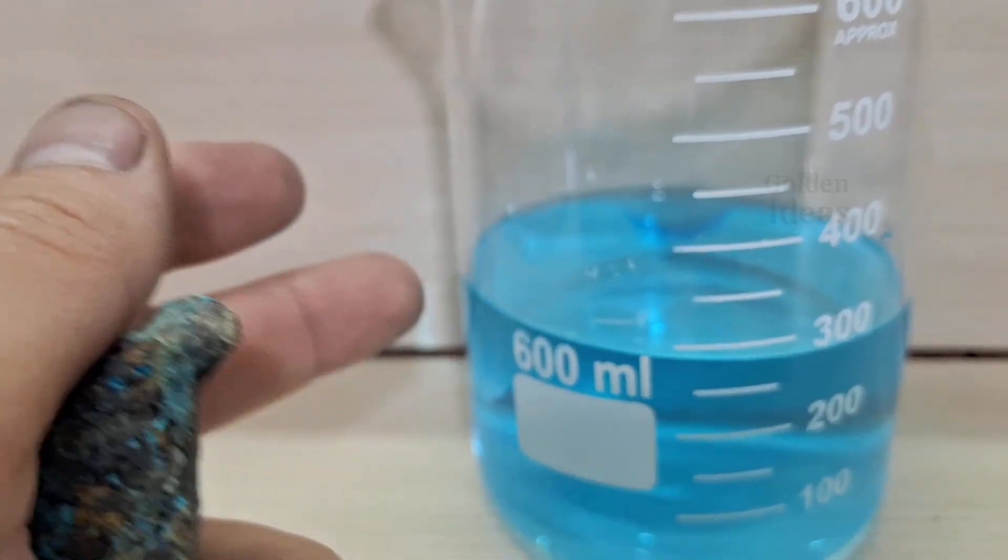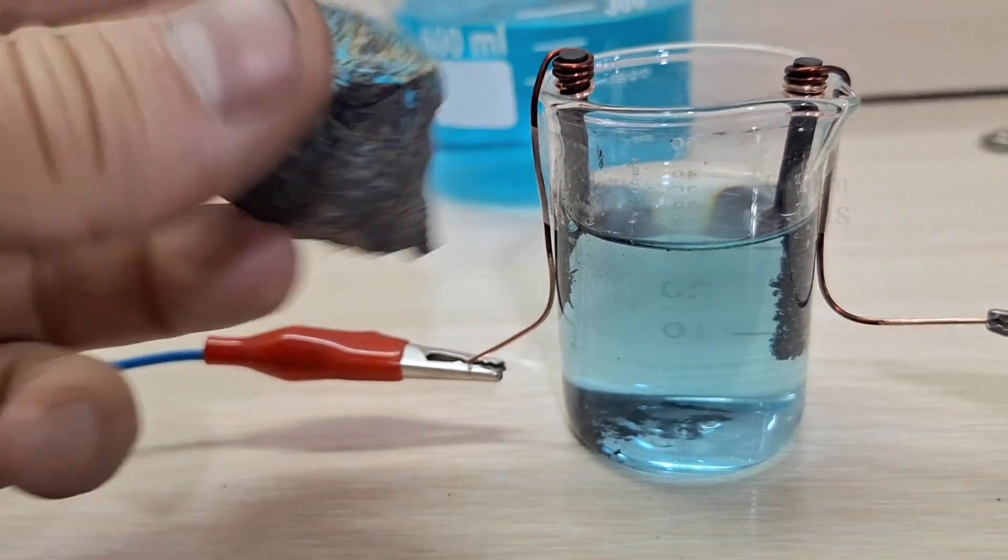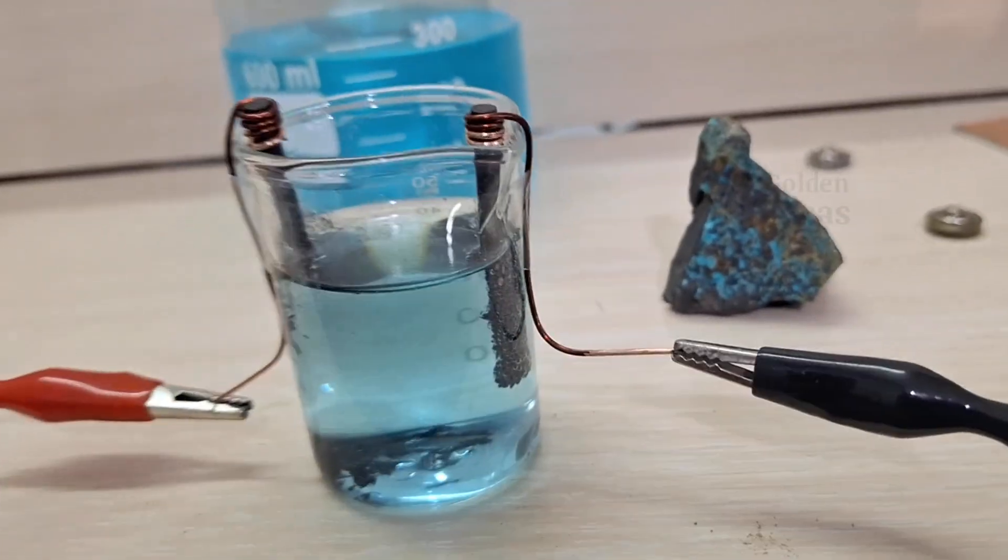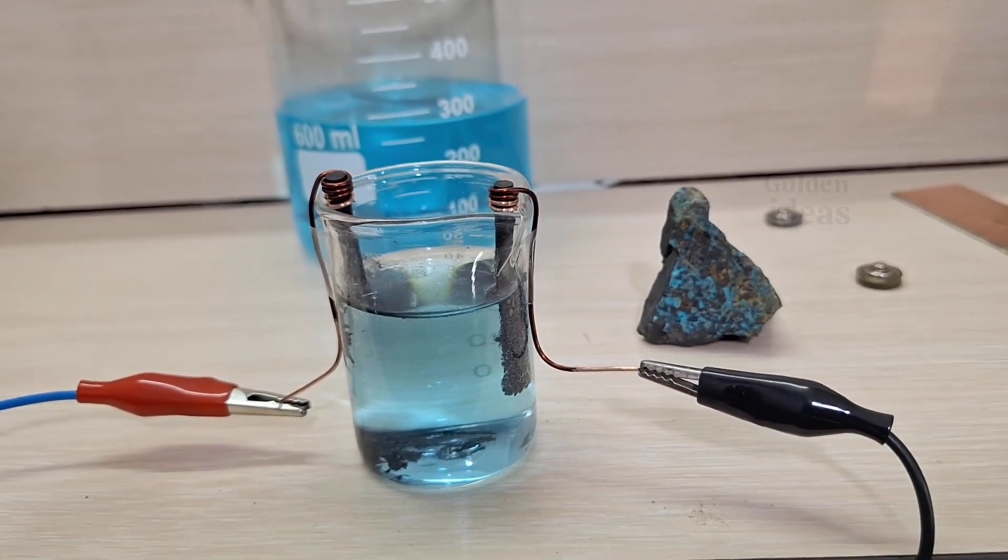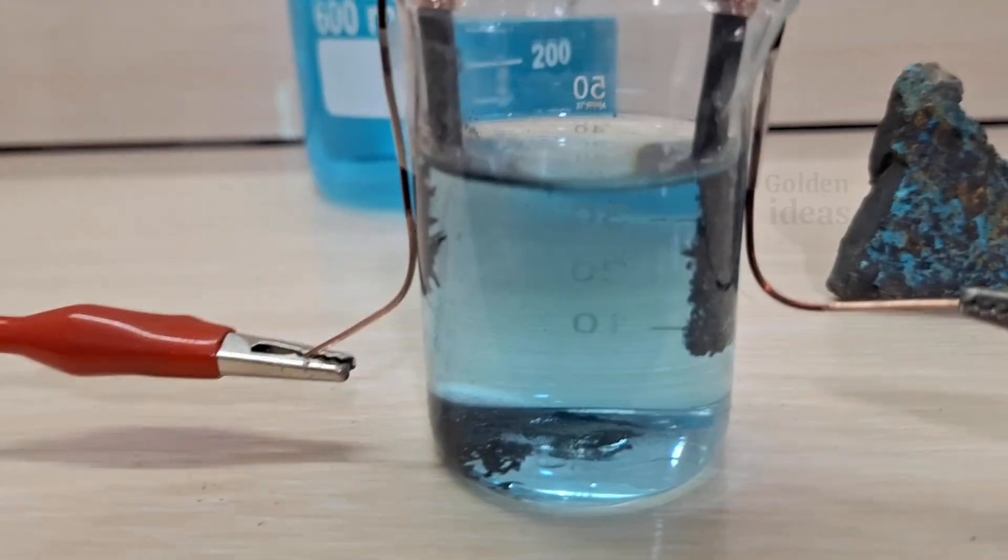Please note, in this experiment, I'm not just focusing on gold precipitation. I want to observe how all three elements, gold, silver, and copper, behave during the process. And I'm especially interested to see what happens when both electrodes are made of the same material.